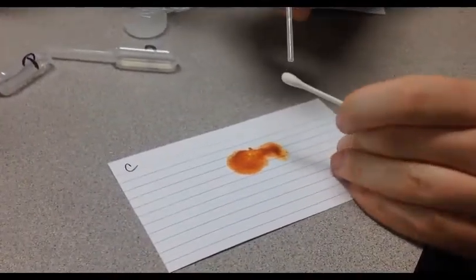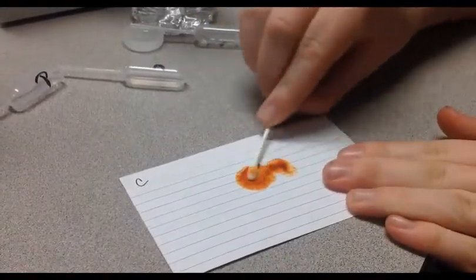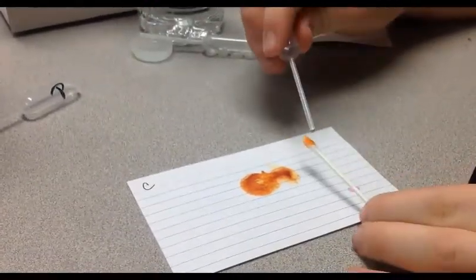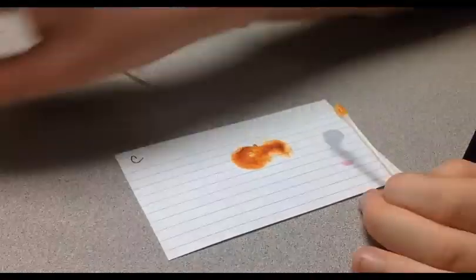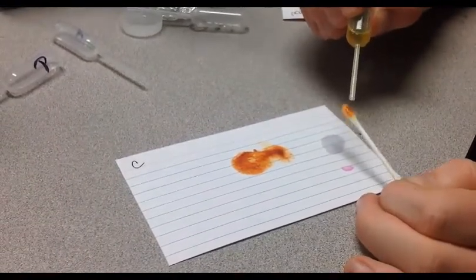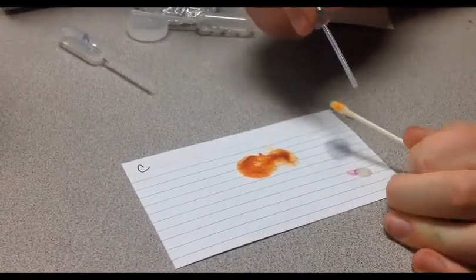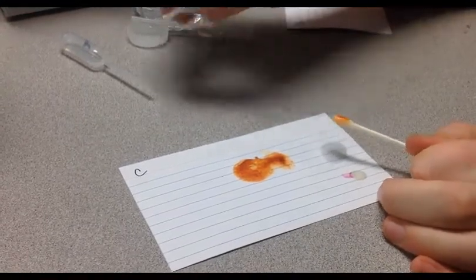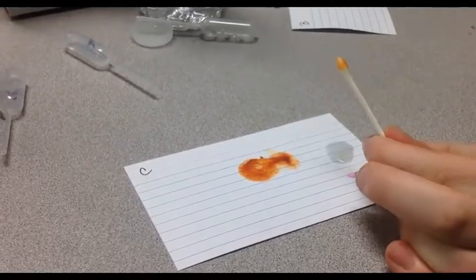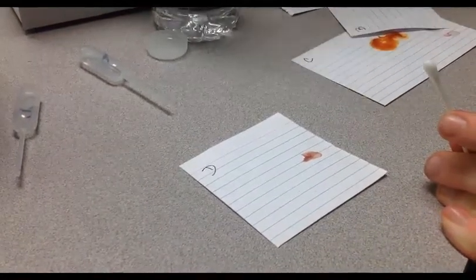C. Let's see what it is. We add some water, then we swipe it across the stain, then add the alcohol. Remember, the alcohol breaks up the hemoglobin. Then we add the phenolphthalein, and then we add the hydrogen peroxide, and notice there is no change. So another negative. That is not blood. Just gave out the answer. Now we move to the next one.